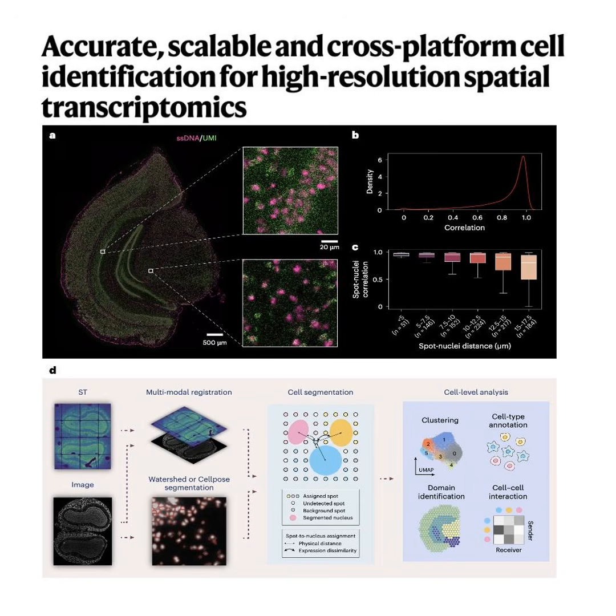The first was spatially agnostic random correlation. Okay, walk me through that. They took all the individual transcripts that Cellist assigned to a single cell, then, completely ignoring where those transcripts physically sat on the slide, they randomly split them into two piles. Oh, I see.